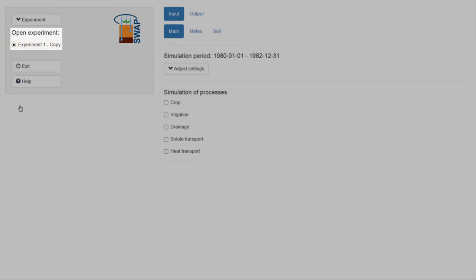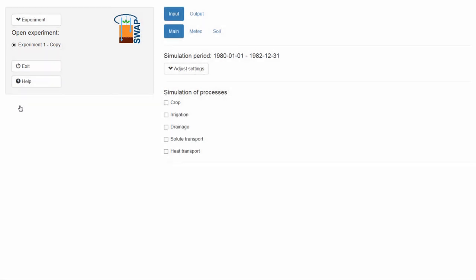As you can see by the name, the experiment is a copy of the predefined version. I advise you to give the experiment a logical name by using the name of some of the settings you used in the experiment.